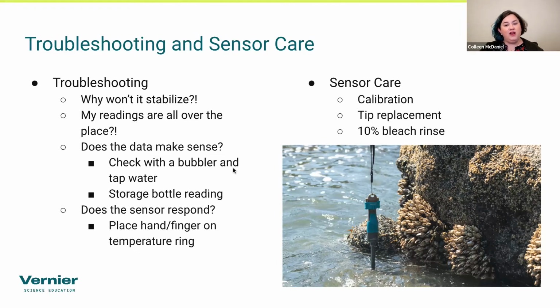The other thing when you're troubleshooting is to look at the data and see if the data makes sense. Sometimes you might get readings where you think, that number, that 4 milligrams per liter, just doesn't seem like the right reading for my probe.